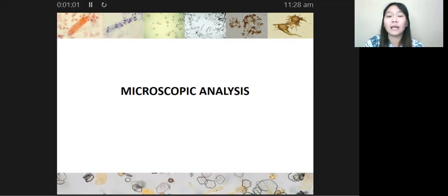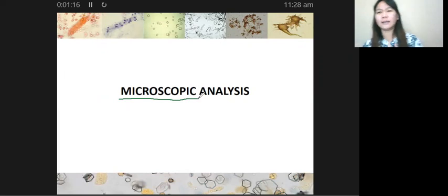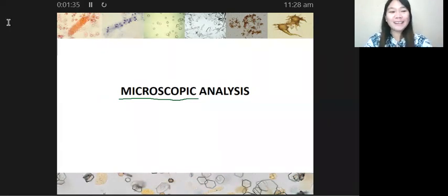So from the term itself, microscopic analysis, we have to review what we have already discussed about your microscopes, so that our brains are refreshed. What are the microscopes that we can use in our clinical microscopy section? Let us bring out everything we know about our microscopes.